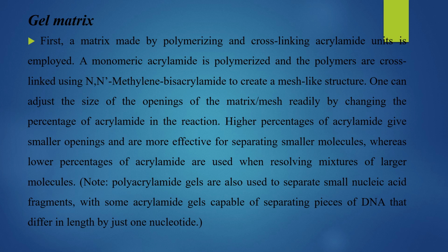Now one can adjust the size of the openings of the mesh by changing the percentage of acrylamide in the reaction. So the sizes of the mesh, the spaces in them, can be adjusted. Higher percentages of acrylamide give smaller openings and are more effective for separating smaller molecules, whereas lower percentages of acrylamide are used when resolving mixtures of larger molecules. So larger percentage for small molecules, lower percentage of acrylamide for larger molecules.